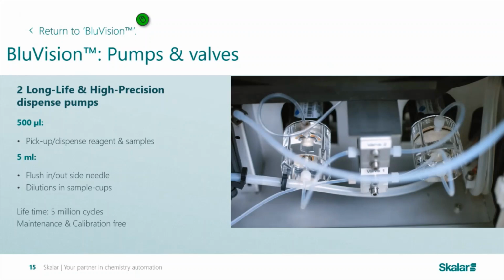And just a quick note on what I mean by calibration free is that the pumps themselves do not require calibration, but in case we do realize that it can be required for audits and accreditation purposes, and it's for that reason that the software does contain a calibration sequence to allow customers to do this.